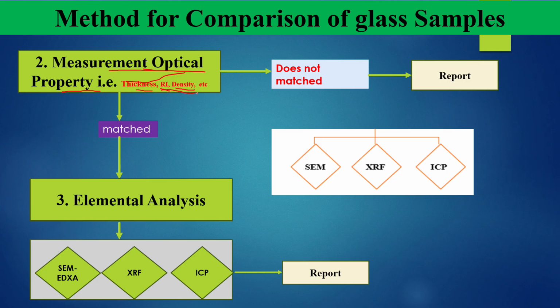These parameters should be measured. In a previous video, I made videos about the measurement of refractive index and density, which are available on the YouTube channel.